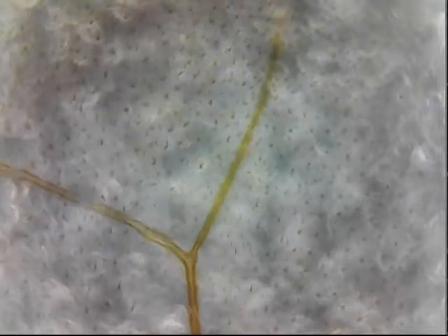Because keep in mind, the paramecium were blue and red. And so were the rotifer — that slide was also very red and blue. The Ascaris were just red. So I'm not sure what's going on there. If you have any idea, please post in the comments — I'd like to hear an explanation.